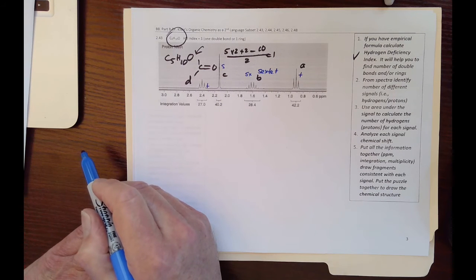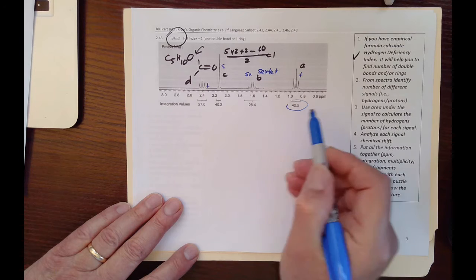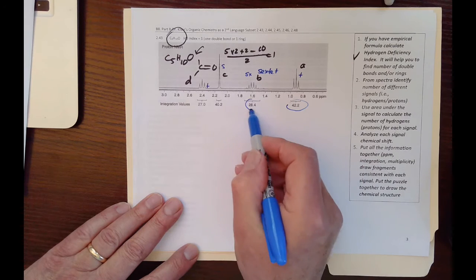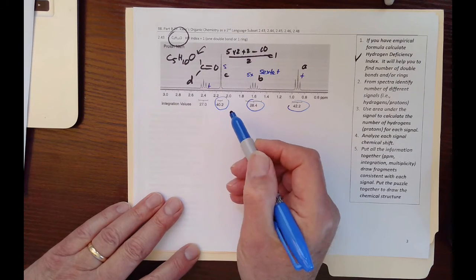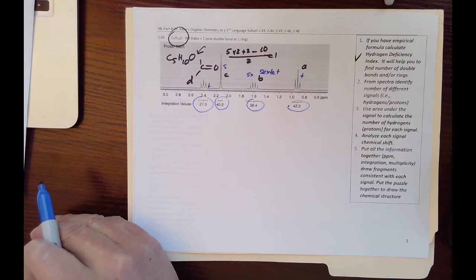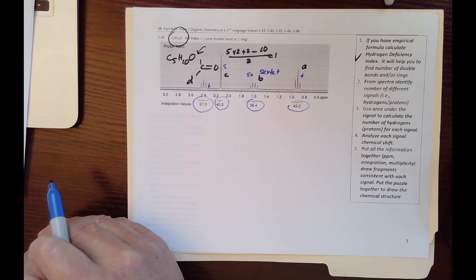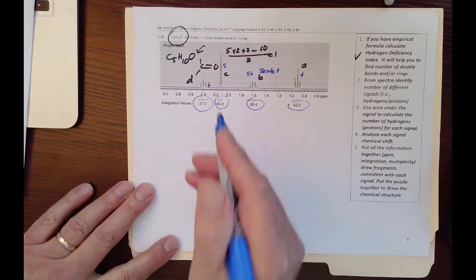Then we need to look at the area under the signal. We have 42, 28.4, and these are actually what the computer measures. And if you remember, we divide that by the lowest number. The lowest number area count is 27.